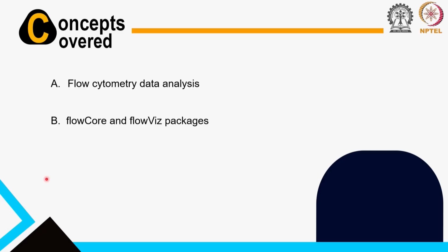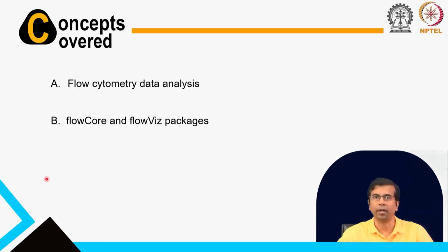So, we will first talk about flow cytometry data analysis and the packages that we will be using, especially the flowCore package which allows us to access the flow cytometry data, and then very briefly I will show you the flowViz package. This is actually for visualization, but we do not always need to use the flowViz package. We can use our own visualization techniques that we have learned, and we can generate very interesting plots and graphics.